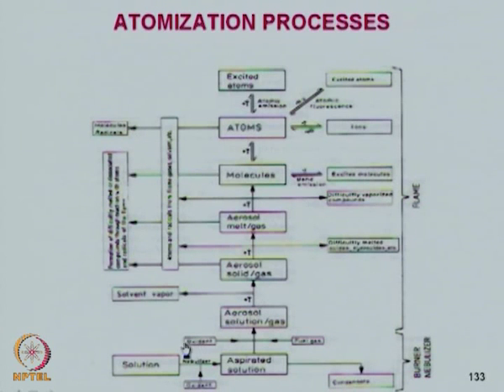The oxidant gas, that is air, is coming here, and then the fuel gas comes here. All these three are mixed to form the aerosol solution gas, and it enters the flame region, and as the temperature increases, the solvent vaporizes and everything becomes aerosol gas, and these liquid droplets become solids, that is all the solvent gets evaporated.